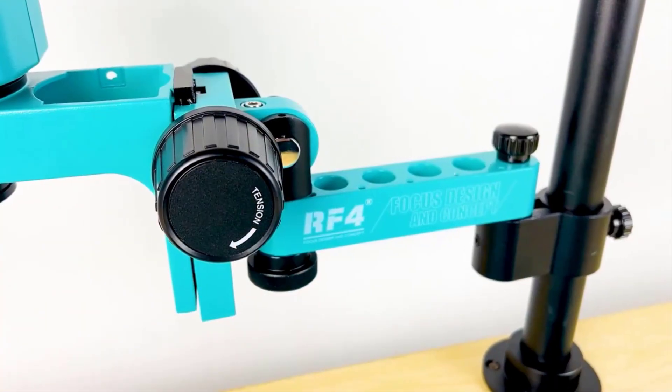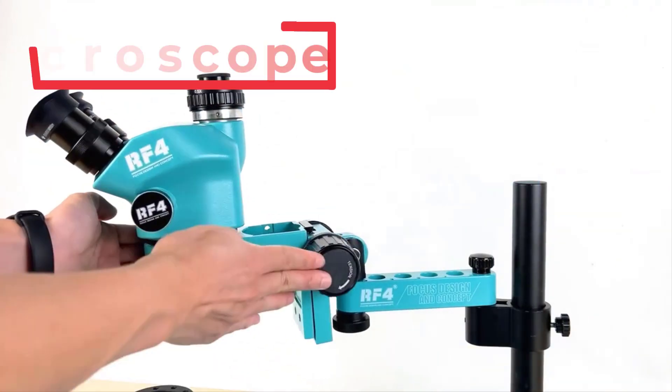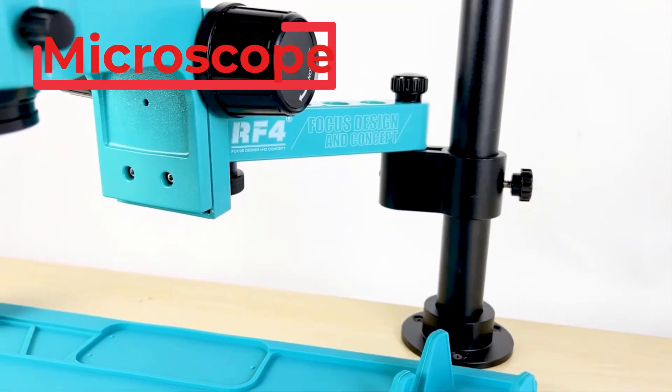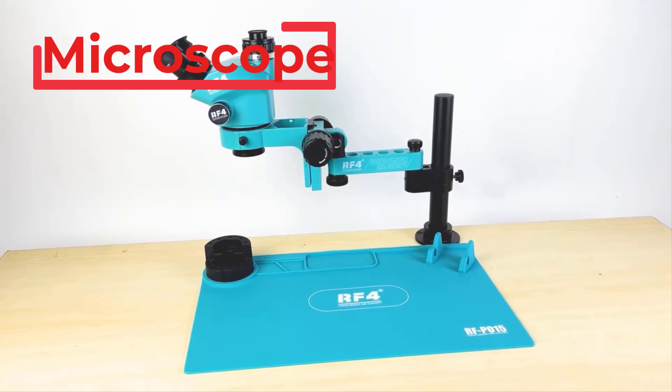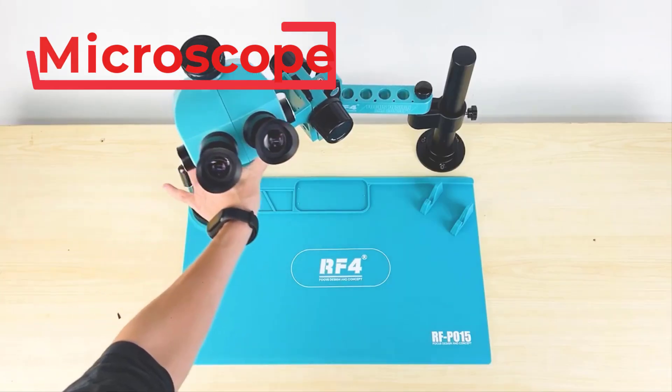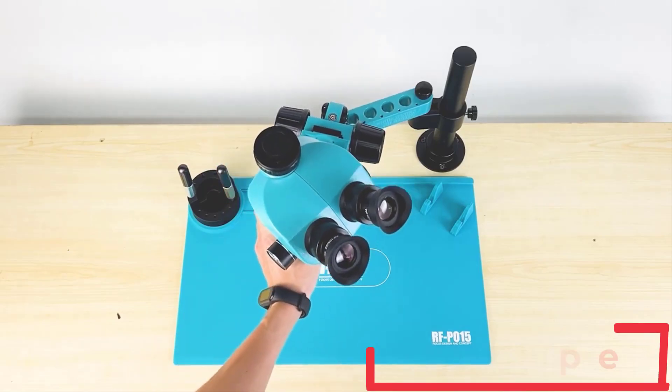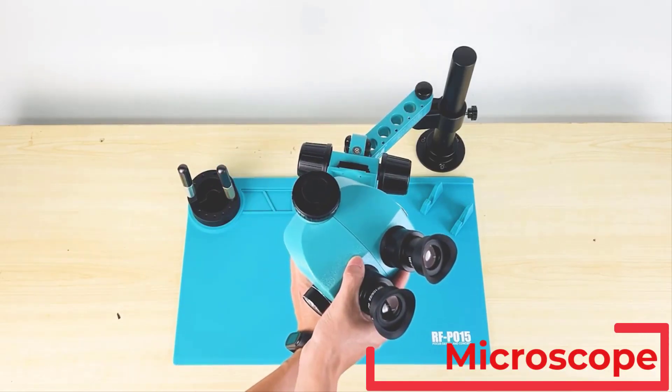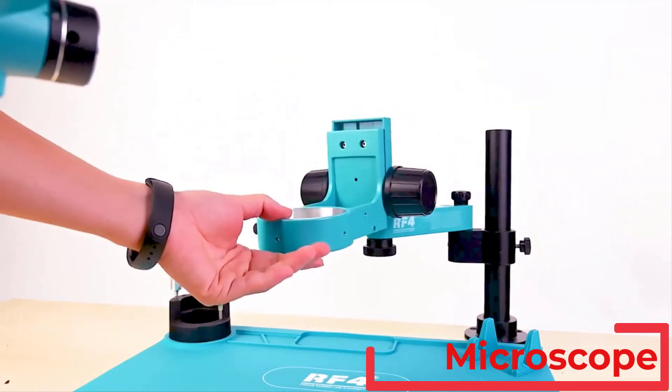Hi, all friends. Are you looking for the best microscope? If so, you're in the right place. In this video, we will review the top five best microscopes on the market. Please note that these microscopes have been upgraded, so if you've received a new microscope, you're in the right place to learn more about it.